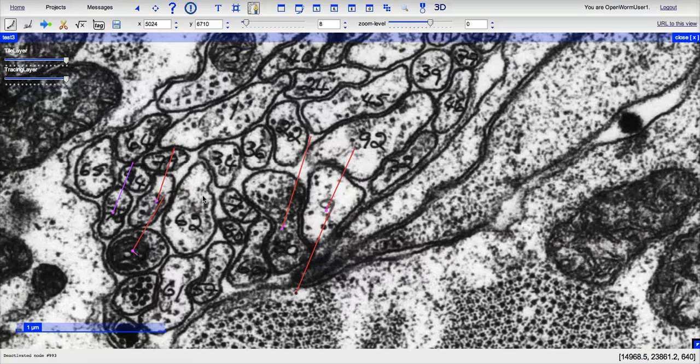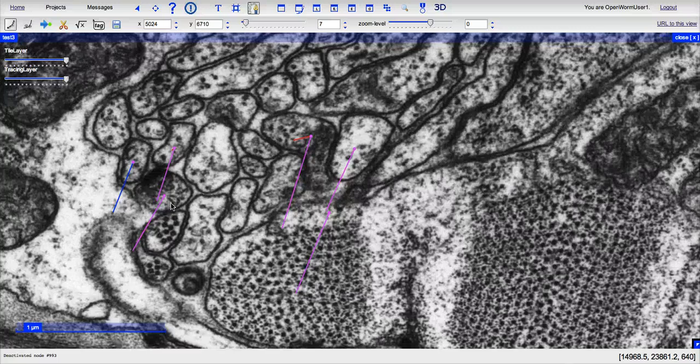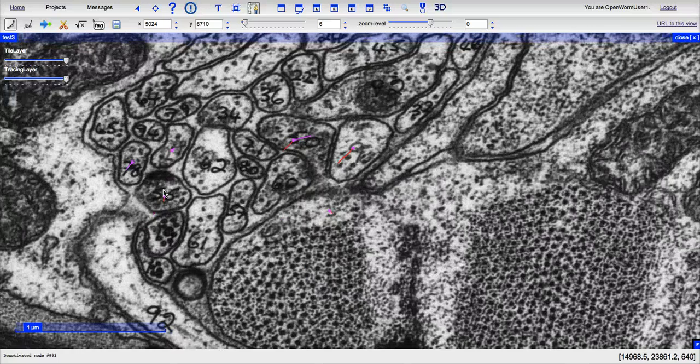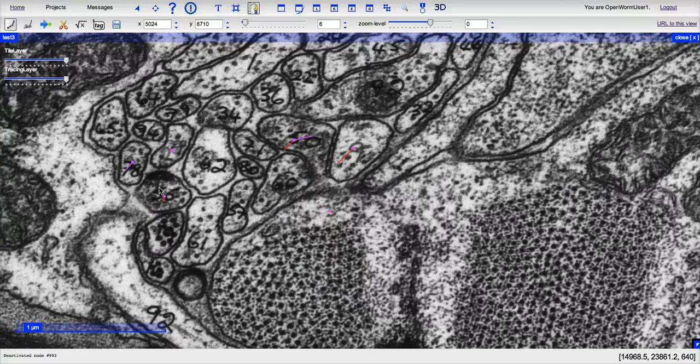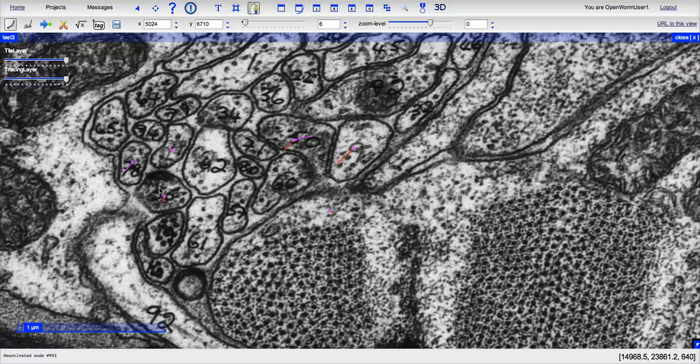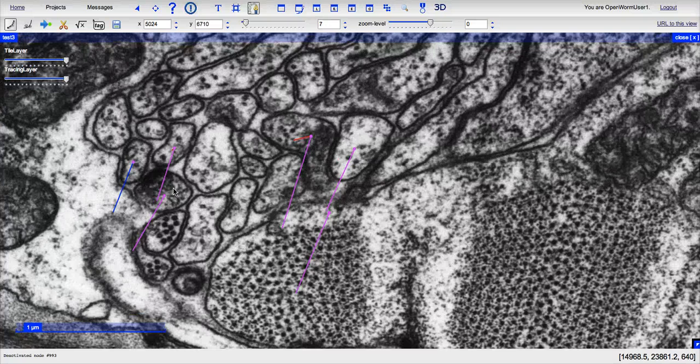Which brings up a point: if you see a presynaptic density such as this one spanning more than one section, just mark whatever you believe to be the most central of the section. So if there are three sections where the synapse is spanning, just mark in the middle synapse.